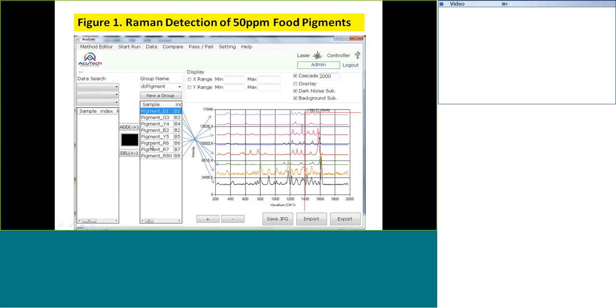So these color dyes are red, blue, orange, and so on. Those are the color differences. That is the yellow color, the green color, the blue color. B2 is blue, then yellow, red, and different ones like red 6, red 7, red 80. Okay, so those are colors. So we get a spectrum, and it's in the library, and now you could detect what's in your food, juice, or jam.